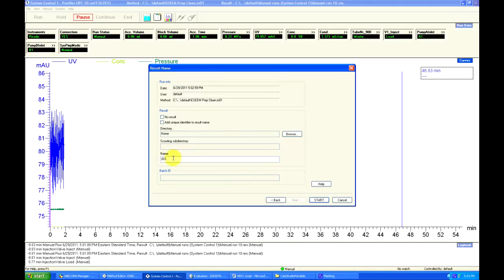Clicking Next two more times shows the result name window. This is where we can name our result file appropriately, as well as control where this file is saved. Clicking Start initializes the run. Now we wait to collect our peaks.